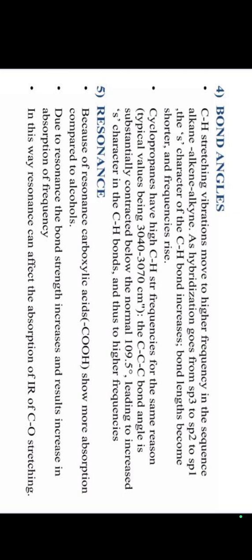Cyclopropanes have high CH stretching frequencies. For the same reason, the C-C-C bond angle is substantially contracted below the normal 109.5 degrees, leading to increased s character in the CH bonds and thus to higher frequencies. The fifth one, resonance.